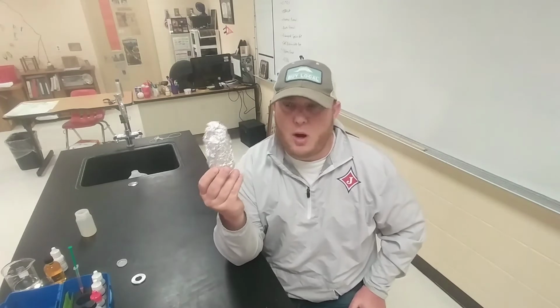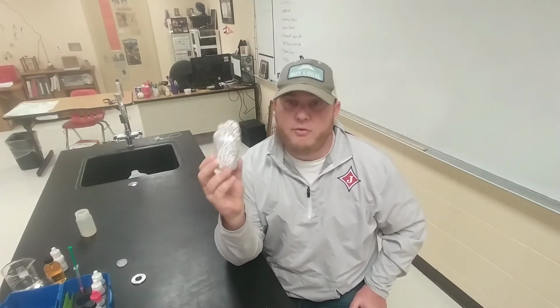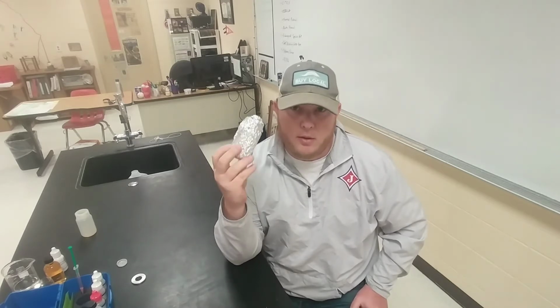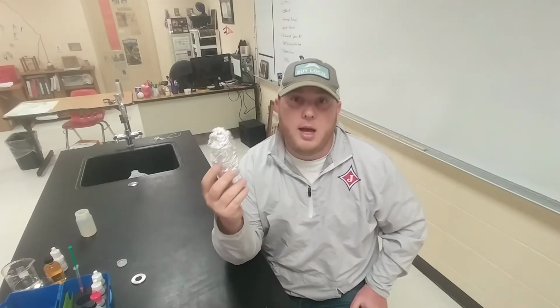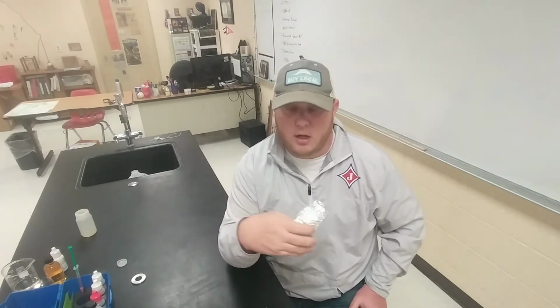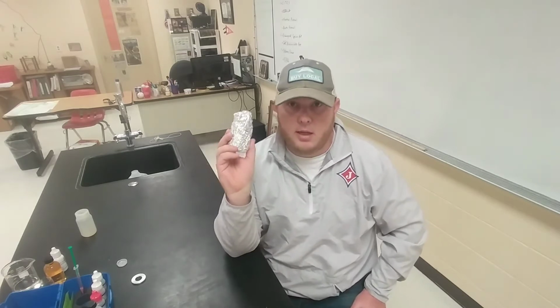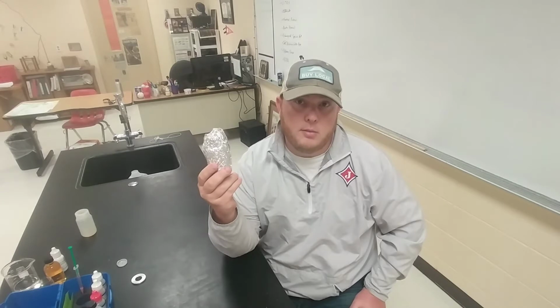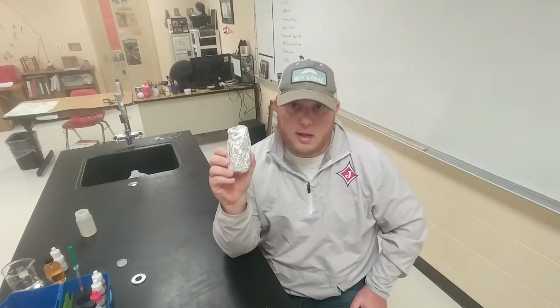That is why we have covered our sample bottle with aluminum foil, so there can be no light to penetrate inside and it's totally dark. That way there's no photosynthesis that can occur to create any more oxygen. The only thing occurring in this bottle is decomposition of the organic matter by microorganisms, where they use up all the available oxygen inside the sample.